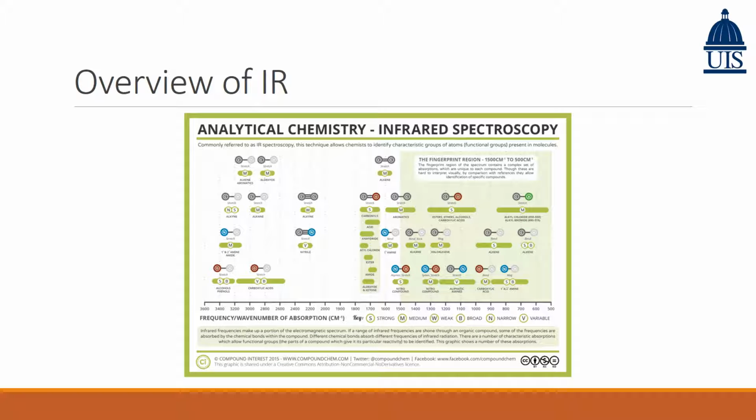What infrared spectroscopy is going to be is basically they take this infrared light, they blast it into the molecule, and based on the vibrations across this frequency and wave number, they can tell what functional groups may be present.